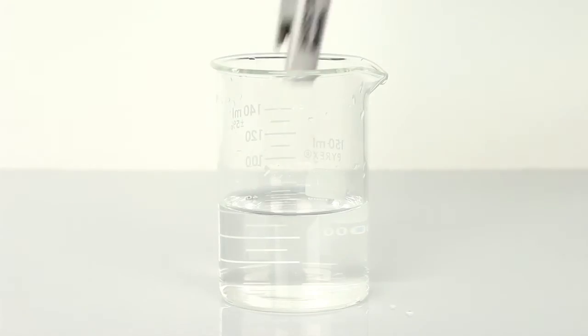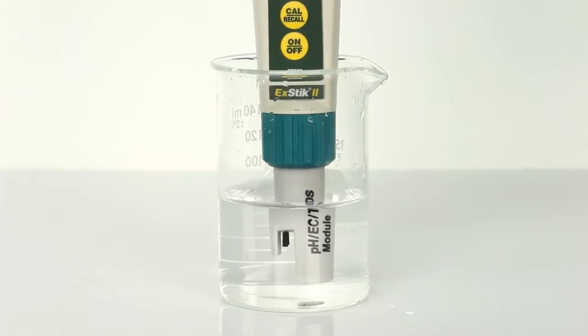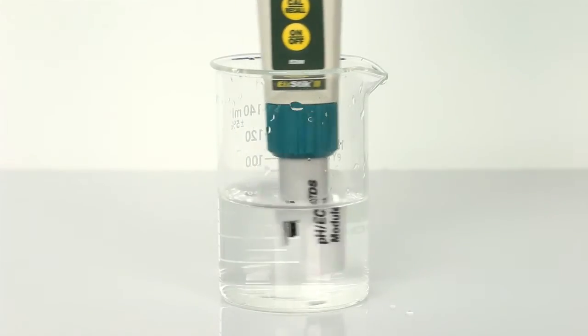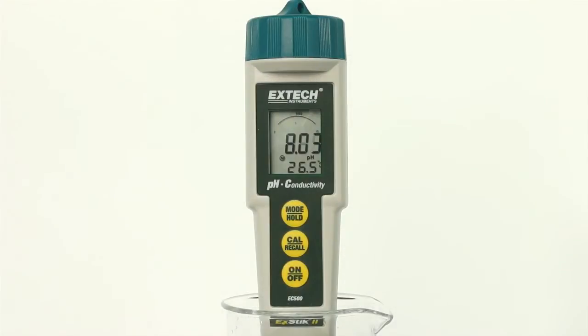Insert the electrode into the sample, making sure that the electrodes are completely submersed. If in conductivity, TDS, or salinity mode, slowly stir to remove air bubbles. The meter will auto-range and then display the reading.